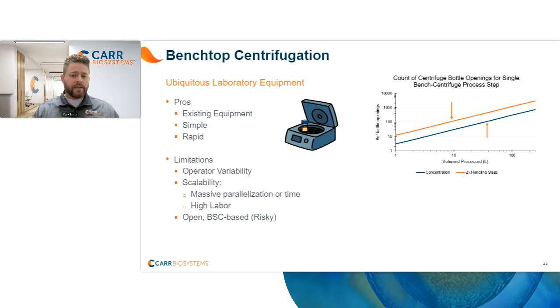And so one way to think about that risk is in this top right graph. As you process more volume, you're going to open a bottle more often. And the more often you open a bottle, the more risk you have, even inside of a biosafety cabinet.